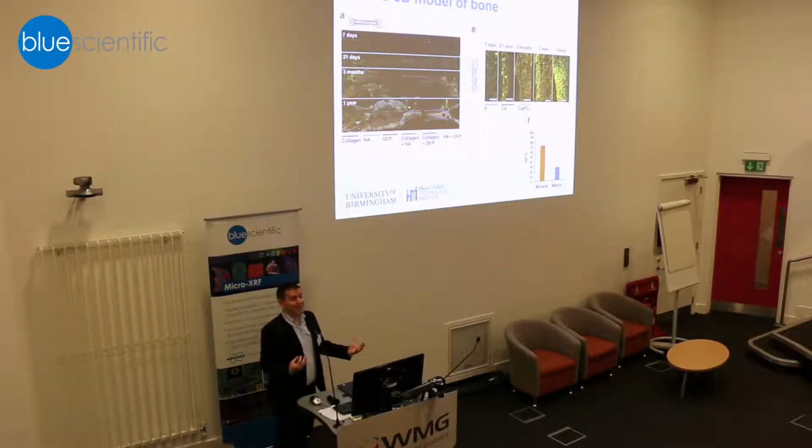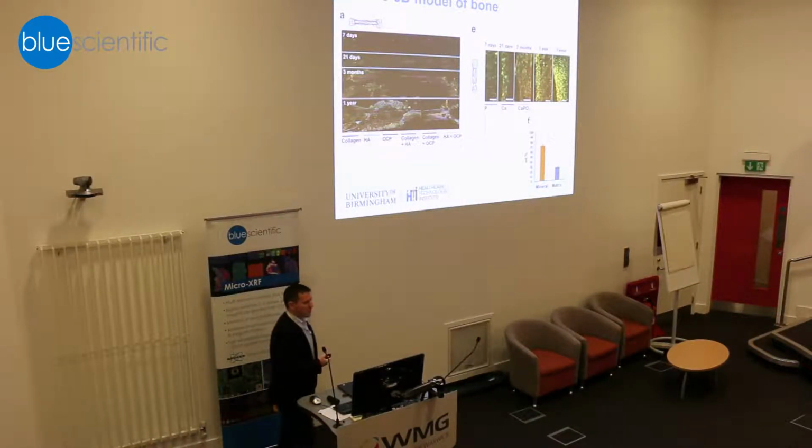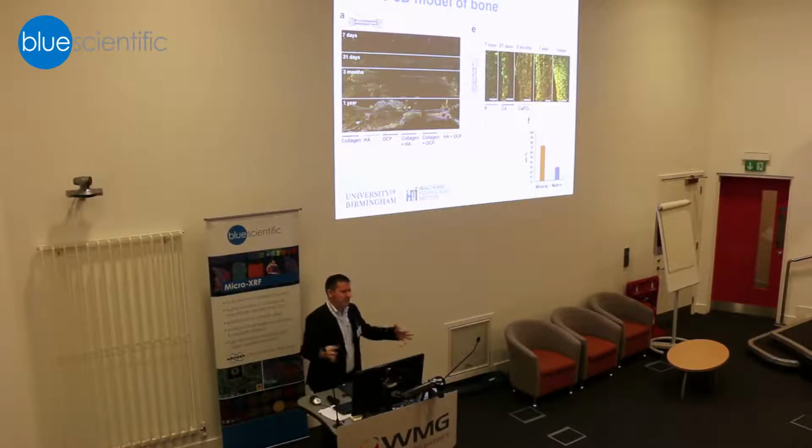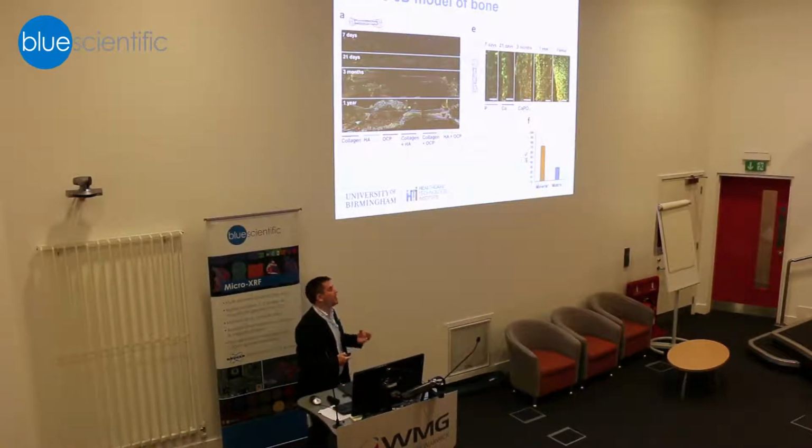And this is where we use 2 techniques. Before, we used to just use Raman on its own, which is a technique we use for looking at organic species, but we look for how atoms are bonded together to make different phases of calcium phosphate. But we use XRF here as a rapid screening tool. So we want to look inside these hundreds of different bone models that we make and understand where the mineral is and how much of it is there.